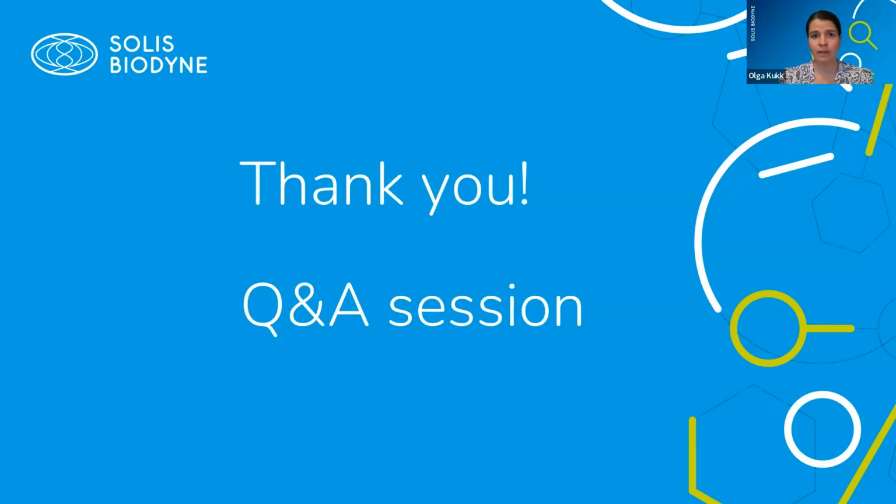Okay, next one up is Mikko. You mentioned carryover contamination. How common is this? And how well do your mixes actually protect against it?